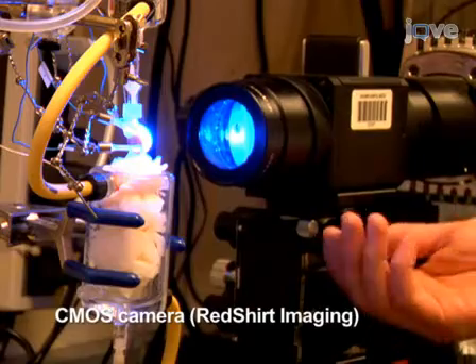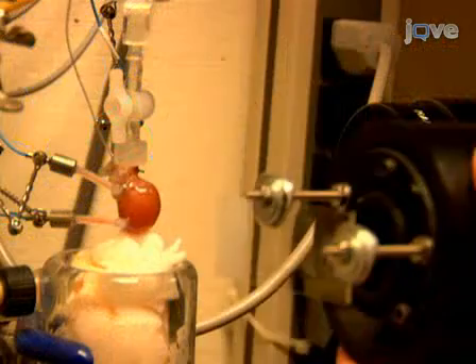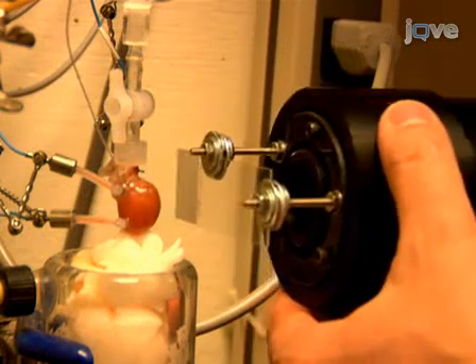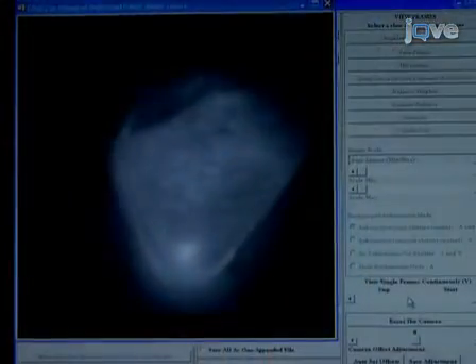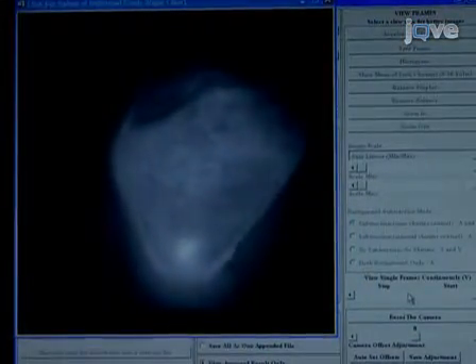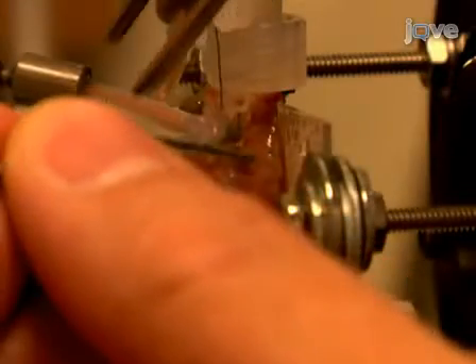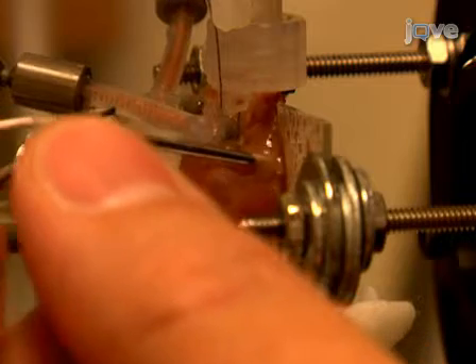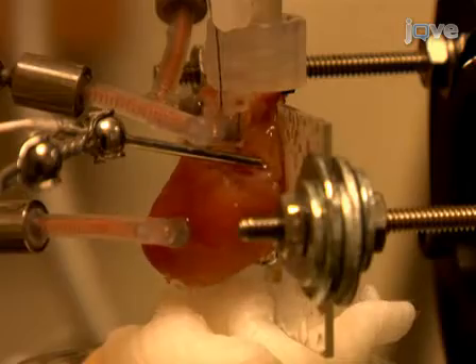Position the CMOS camera using the XYZ adjustments. A piece of glass positioned in the focal plane of the camera is placed on the surface of the heart, so that the area of interest is in focus and centered in the acquisition frame. The camera and optics are mounted on a vibration isolation table to minimize resonant frequencies. At the same time, on the right atrium, place a coaxial pacing electrode controlled with an isolated S48 electrical stimulation unit.